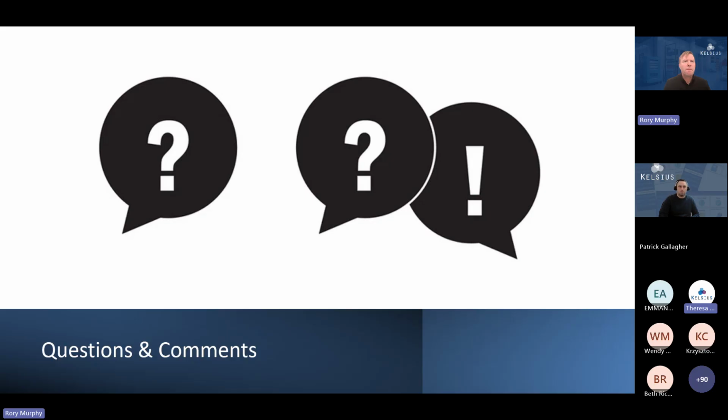Another question's come in. How many sensors should be used to map a walk-in cold room? I don't have any details on the size or number of them, but maybe you could give us an indication. Yeah, it's a good question and one that comes up frequently. So for a small walk-in, say 20 cubic meters, you would typically use between 9 and 15 sensors for mapping that. If it's a bigger, maybe like a 50 or 60 cubic meter, you'd probably go with between 15 and 25 sensors.